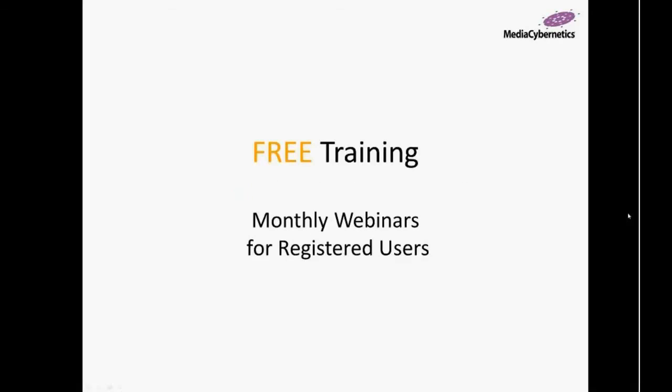Also, starting brand new with 9.1, free training options. For anyone who has purchased an ImagePro Premier product, we're going to begin having monthly webinars for registered users, and those will be once a month on a specified date that will be sent out to all the registered users. They'll know exactly when it is in advance and be able to sign up for those, much like you're doing today on a webinar, visualizing a lot of the content and a lot of information about how to use individual features.